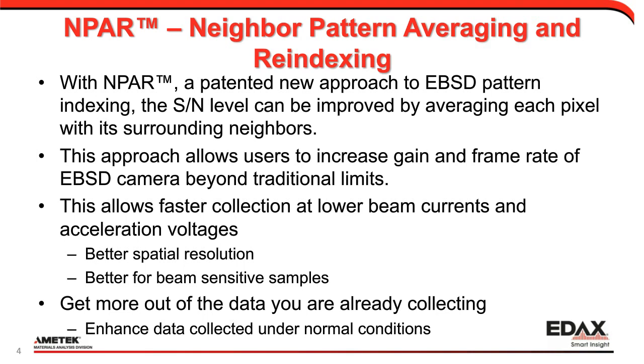Again, I've been finding NPAR very useful for things like ceramics. It seems counterintuitive, but with non-conductive samples, where charging becomes an issue, I've found the faster I go, the better the data I have. It sounds counterintuitive because I'm getting less signal, but I'm dealing with fewer charging effects. So because I have fewer charging effects, I'm getting more signal, even though I'm going faster, because of NPAR. It changes everything I'm doing in my data collection process.